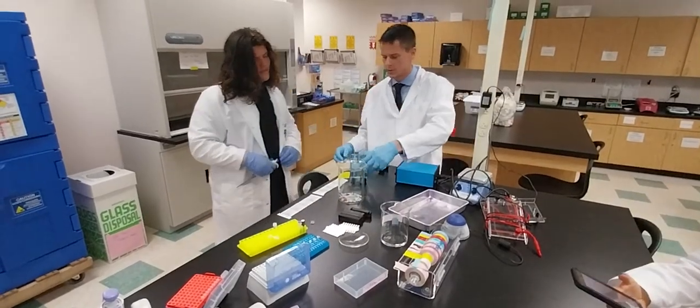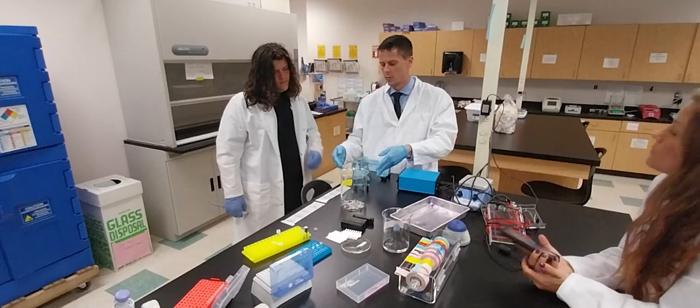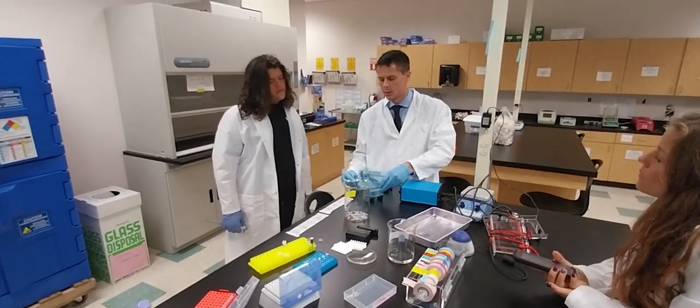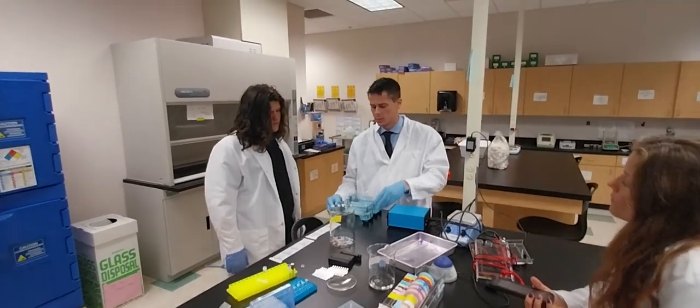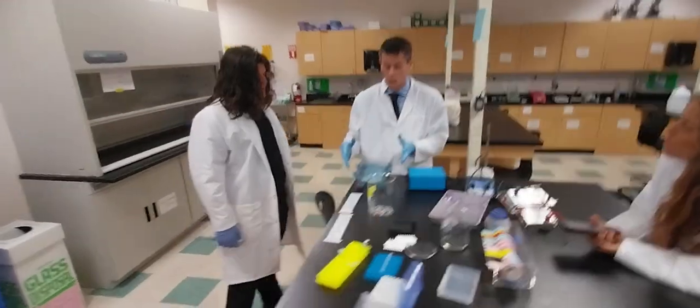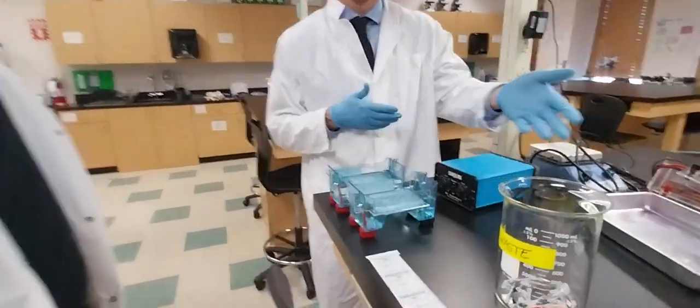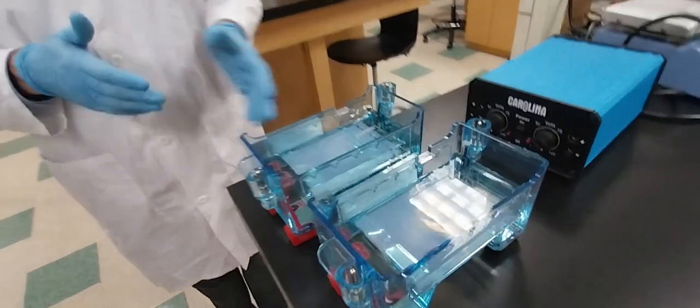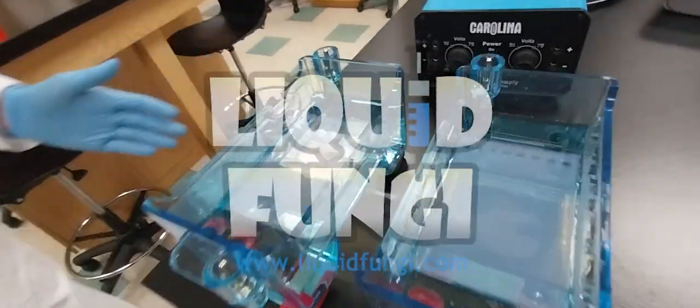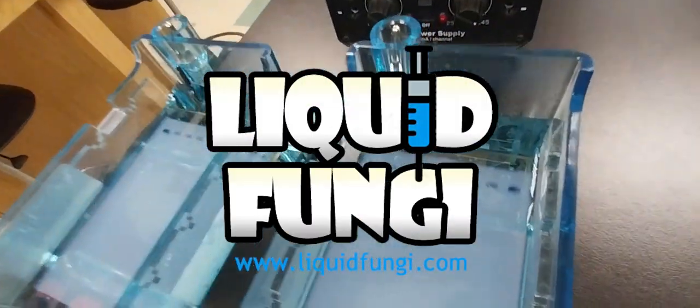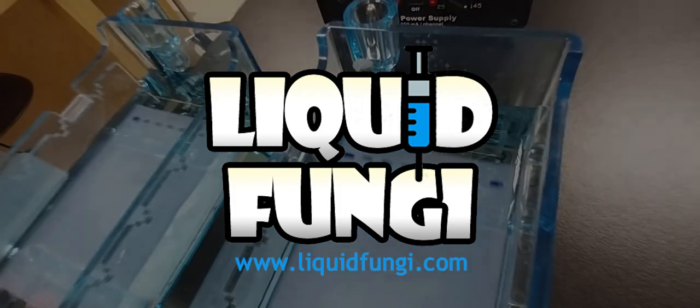So now we have our ladders, and the way these are set up is no matter what, again, things happen, but normally under good conditions, if we made this set up right, we can expect the ladders to light up even if our PCR product doesn't light up. That is, again, this is our ruler that we measure against, right? Expensive companies make these ladders.